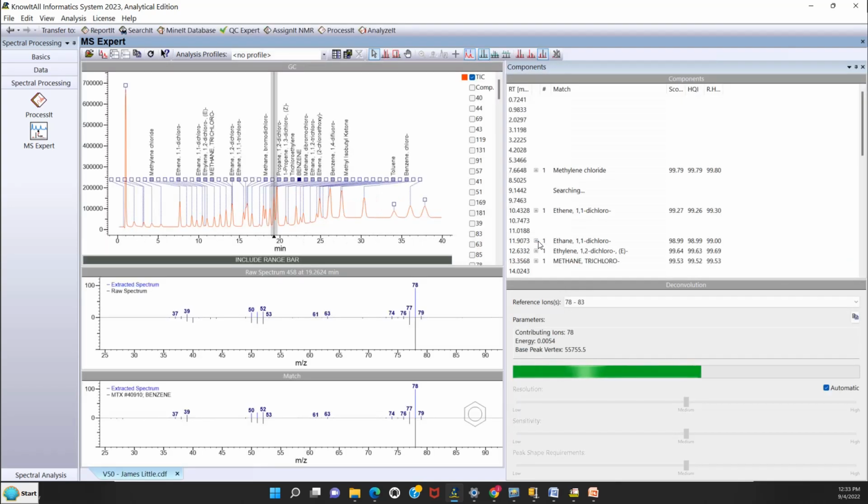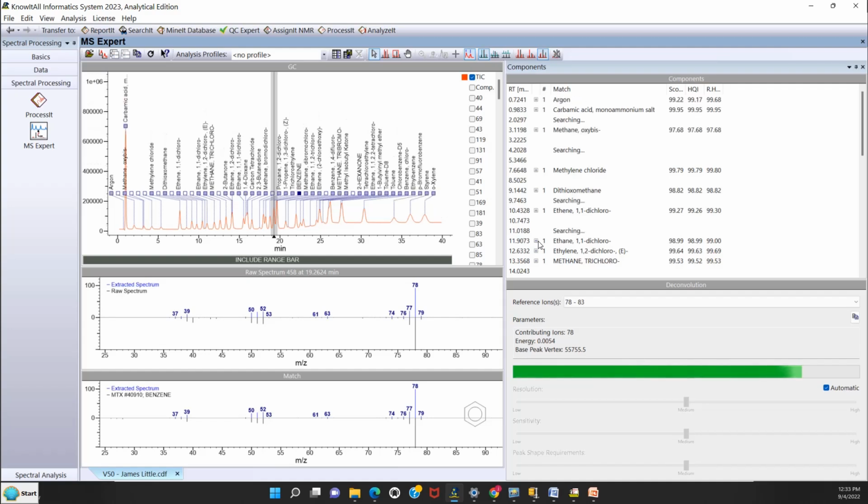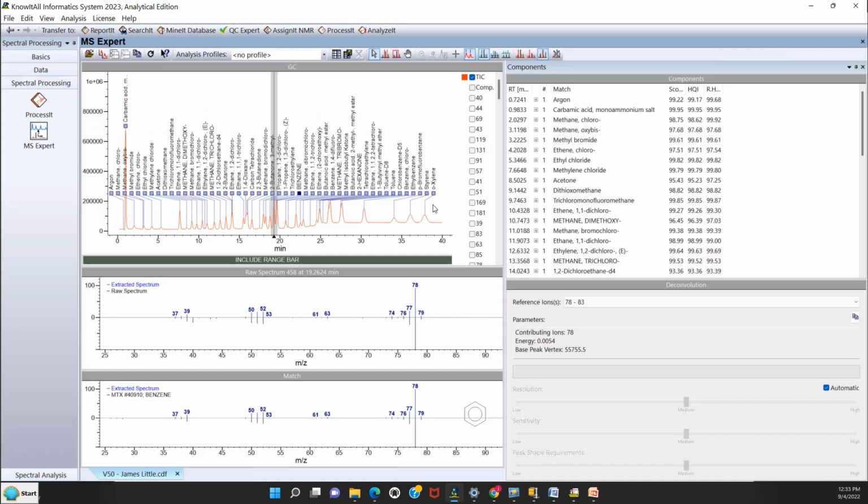What's happening is it's doing all that work, but it's doing it amazingly fast. You can see all the identities being populated, and it searched essentially for all of those components that were here. It did 1.2 million spectra compared to the unknown to find the best fit, which is really amazingly fast. So if you look at the bottom here, let's go pick one of them.